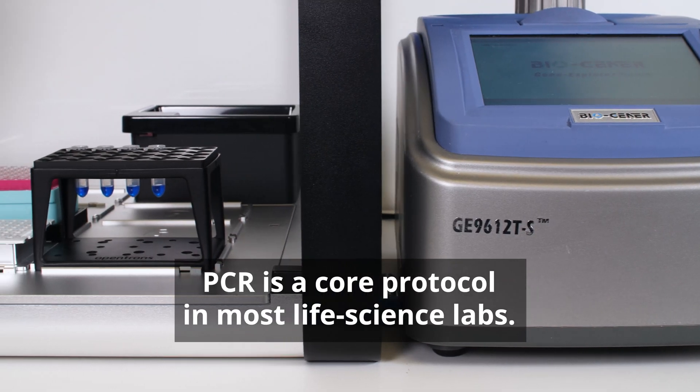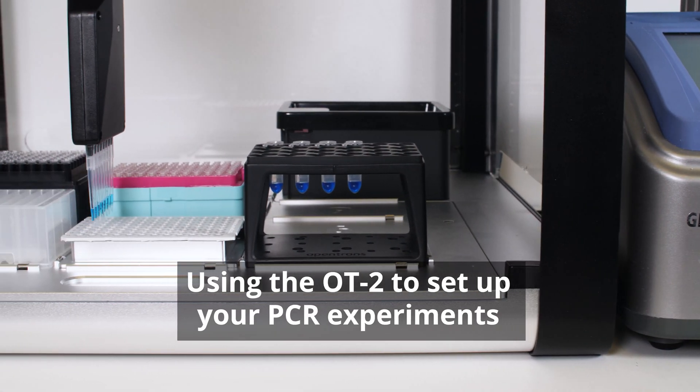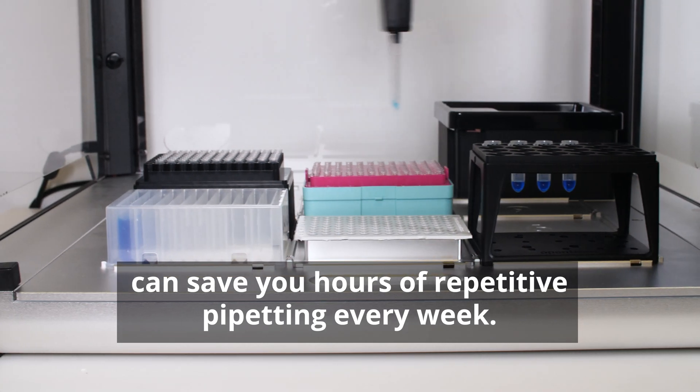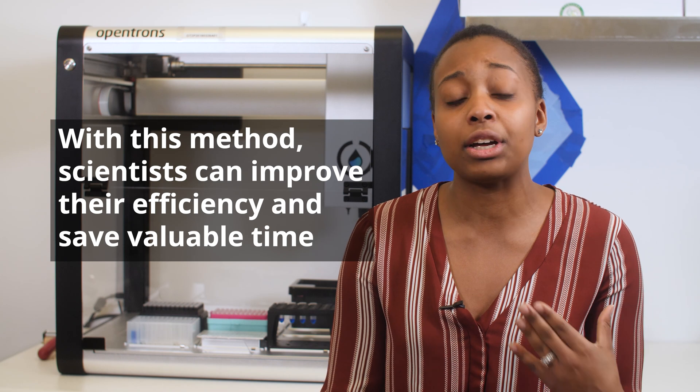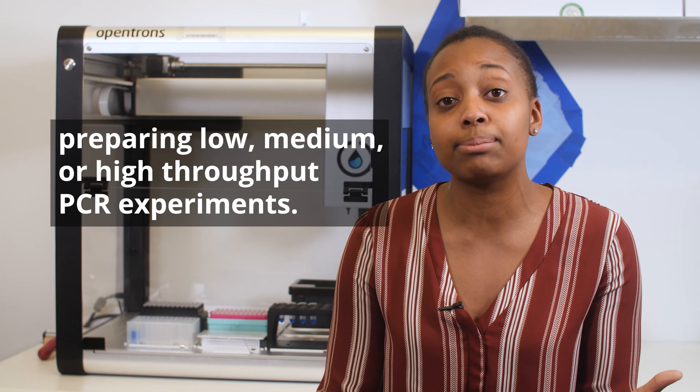PCR is a core protocol in most life science labs. Using the OT2 to set up your PCR experiments can save you hours of repetitive pipetting every week. With this method, scientists can improve their efficiency and save valuable time preparing low, medium, or high-throughput PCR experiments.